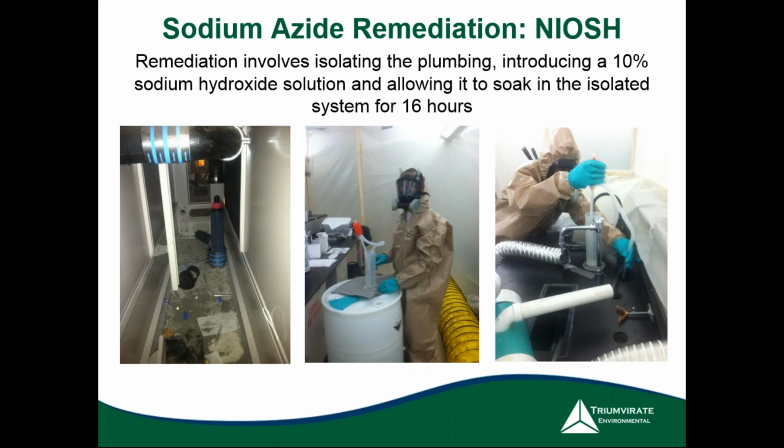And after that's done, according to the NIOSH and CDC plan, a 10% sodium hydroxide solution is administered to the system. You can see our technician doing it there. And that solution is allowed to soak in the isolated system for 16 hours. And that soak is basically corroding the copper and breaking down any organic material.